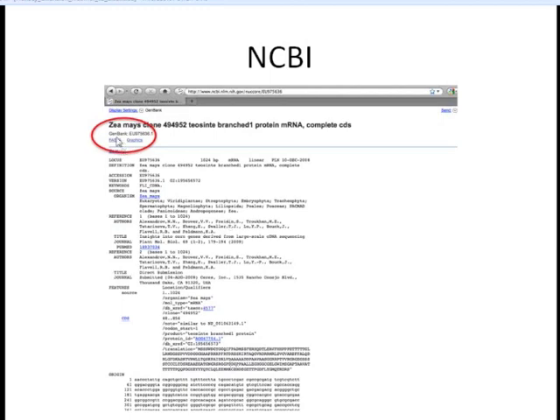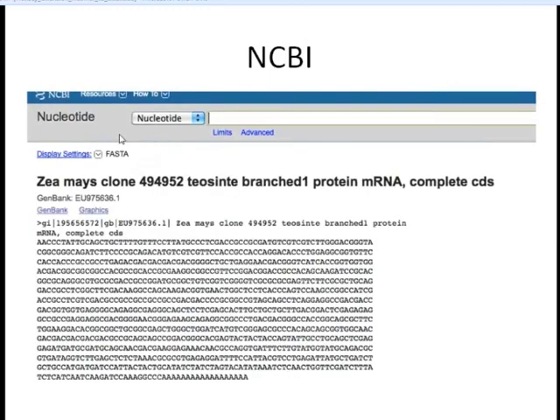We have a link up here where we can click and get the FASTA sequence. Or you can use display settings, which will allow you to select additional formats other than FASTA. For now, we're going to just click on the FASTA link. You can see we now have this sequence in FASTA format. FASTA format starts with a greater than symbol, followed by a descriptor, and the next line starts the sequence. That sequence continues until the next greater than symbol, if there's more than one sequence in a file. This is a very standard format for bioinformatics work, and this is what we're going to need for our BLAST alignment.